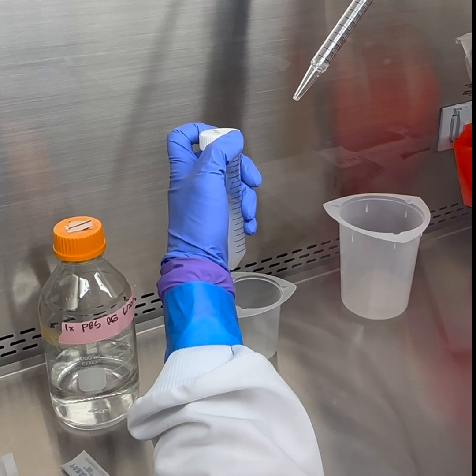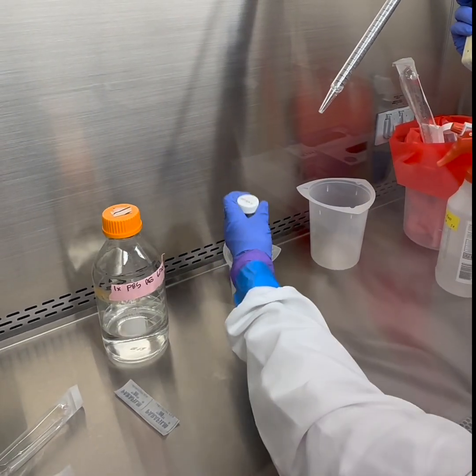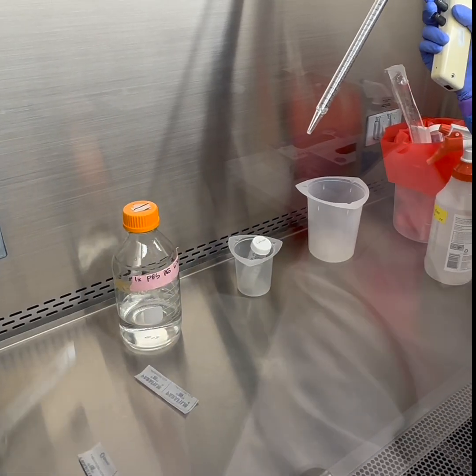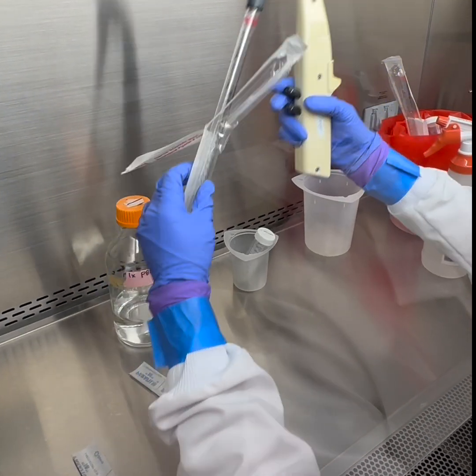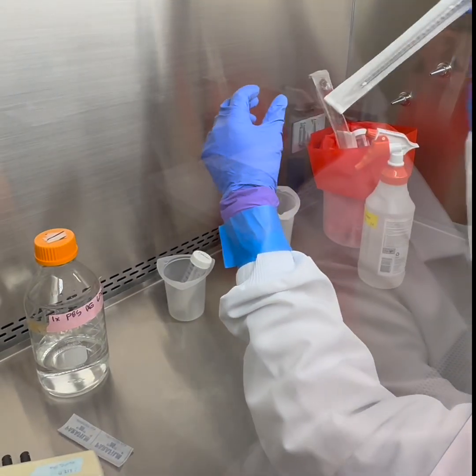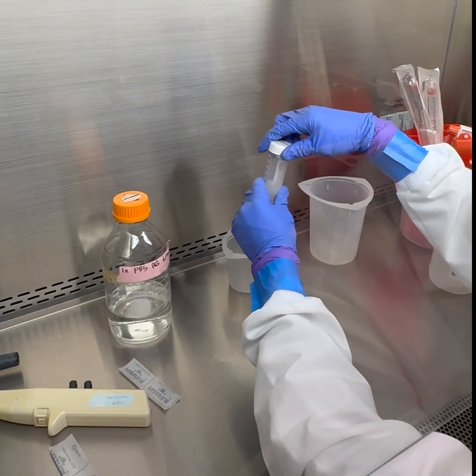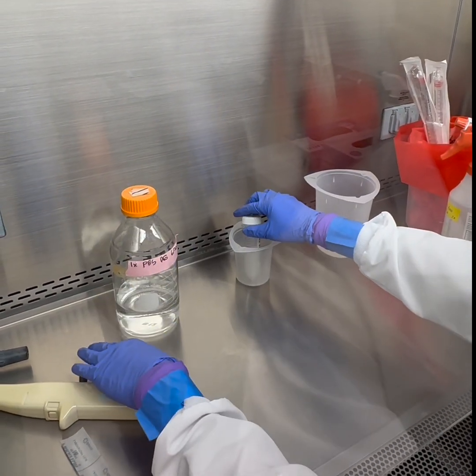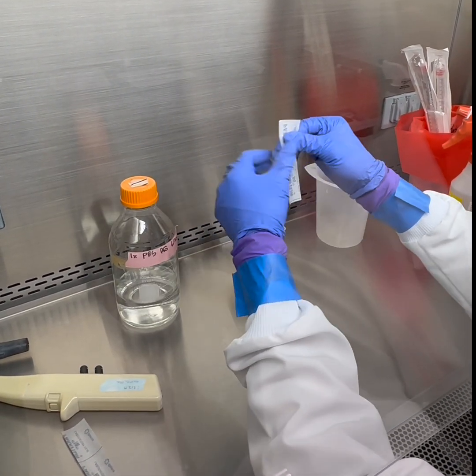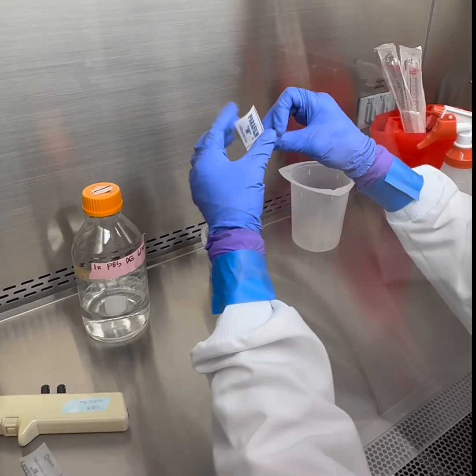So I'm going to cap this 50 milliliter conical. I'm going to re-sleeve this pipette and discard it in our biohazardous waste. Now I'm going to take this and let's see, is this okay, and parafilm the top.